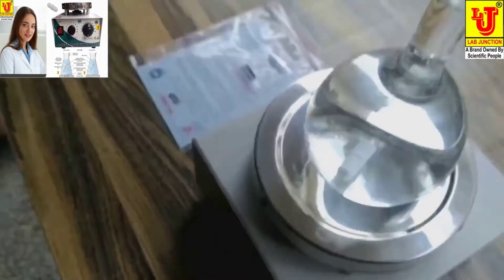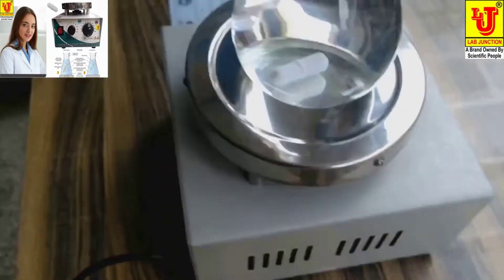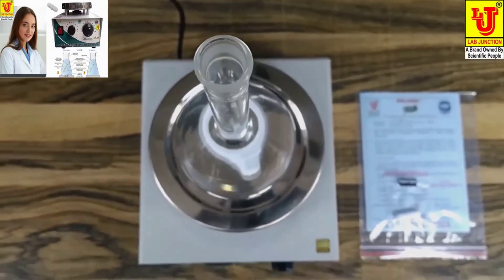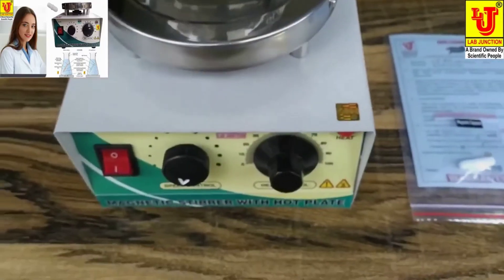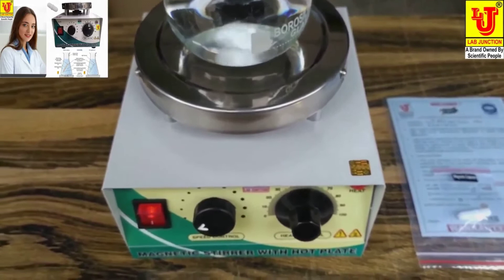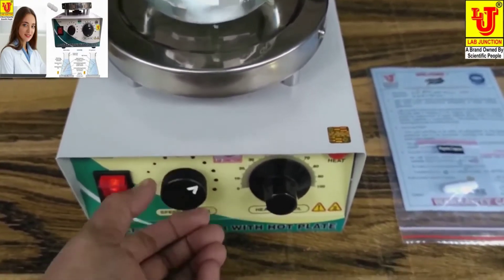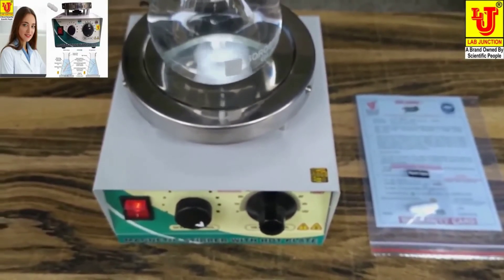Lab Junction Magnetic Stirrer with Speed Controller and Hot Plate LJ 841 as per quality standards.